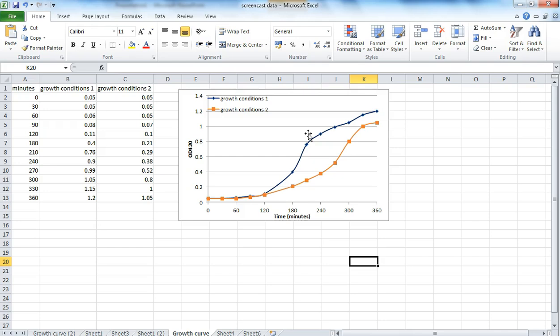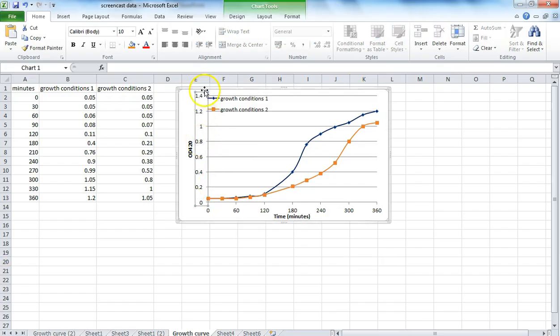So this is for your logarithmic lab report, and this is how we're going to determine the doubling times from the graphs that you've got. If you're up to this point on your own, good work, well done. So what we need to do is make this logarithmic. We're viewing this data on a log scale, because when this is doubling and doubling and doubling, it's really hard to tell whether that's an exponential curve, or whether it starts down here or whether it starts here. It's really, really hard to tell that by eye.